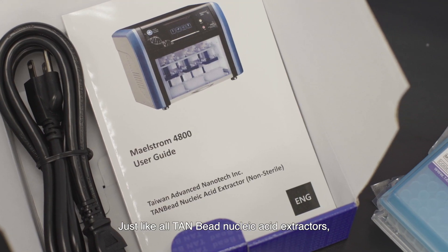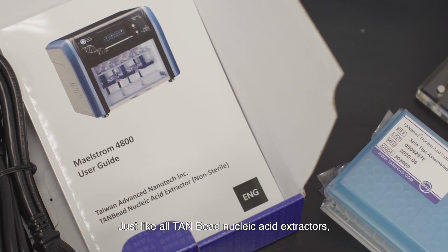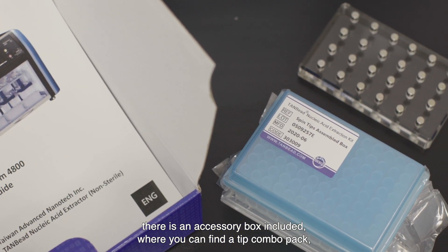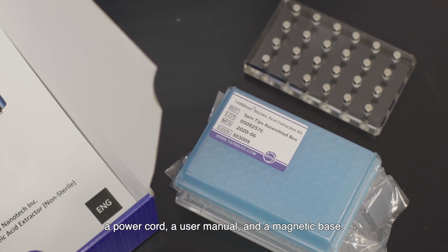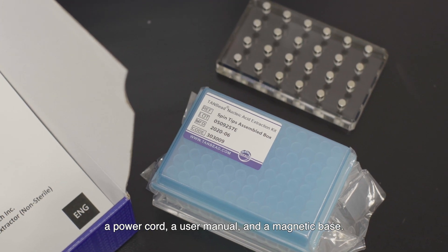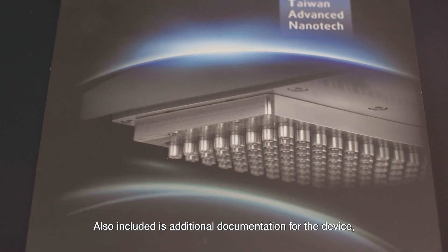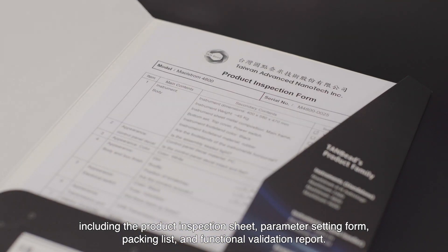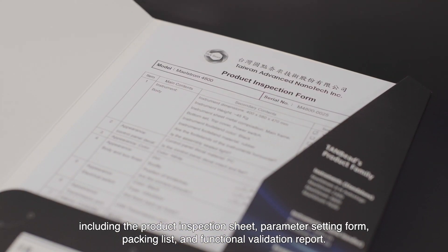Just like all Tambead nucleic acid extractors, there is an accessory box included where you can find a tip combo pack, a power cord, a user manual and a magnetic base. Also included is additional documentation for the device including the product inspection sheet, parameter setting form, packing list and functional validation report.